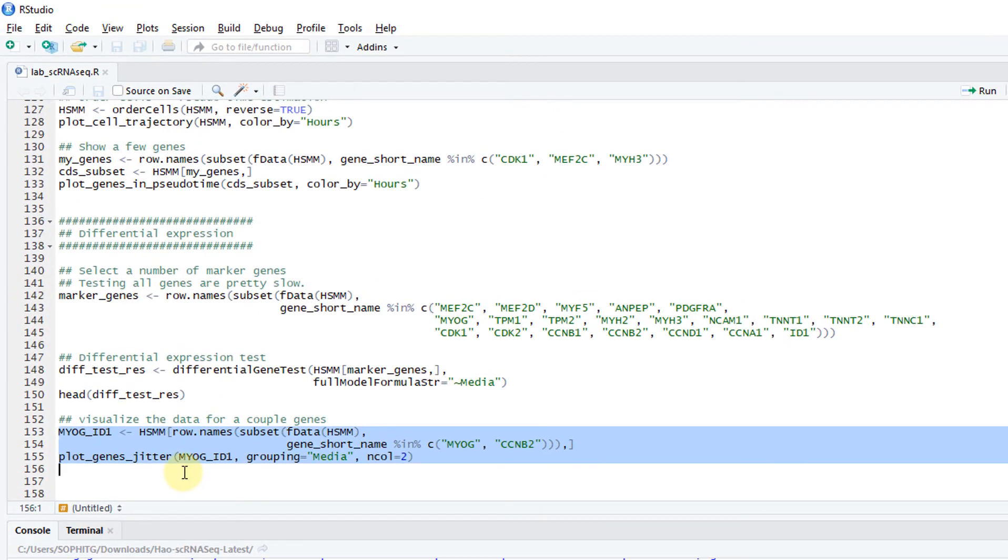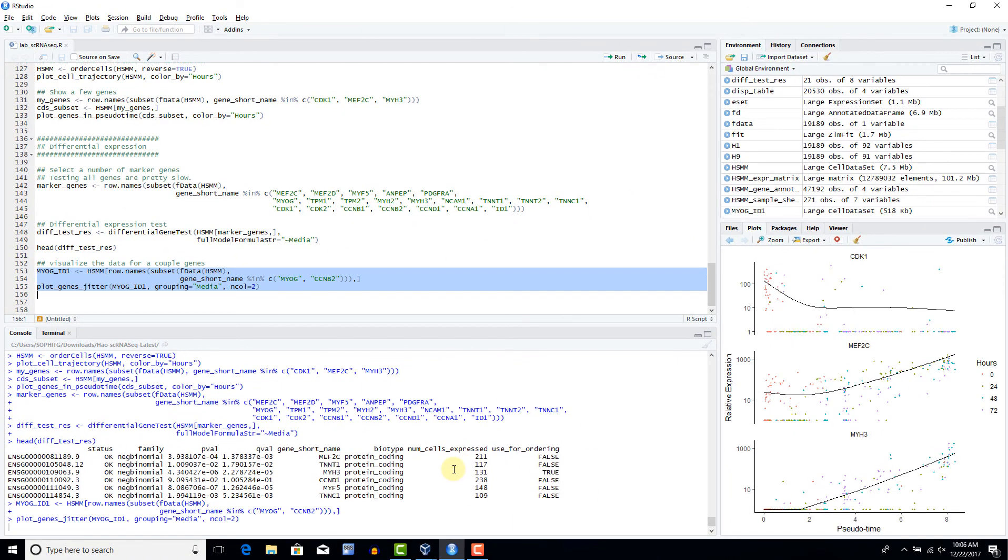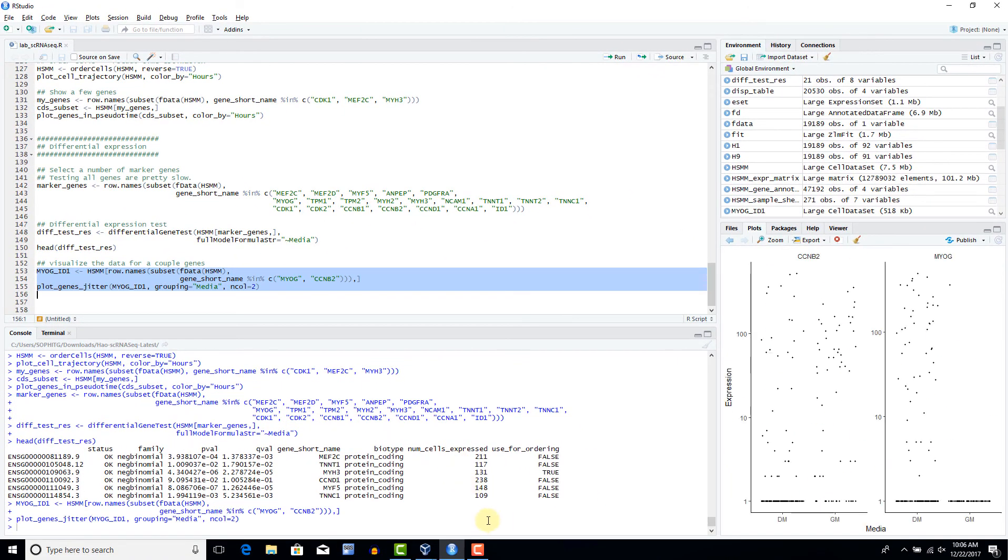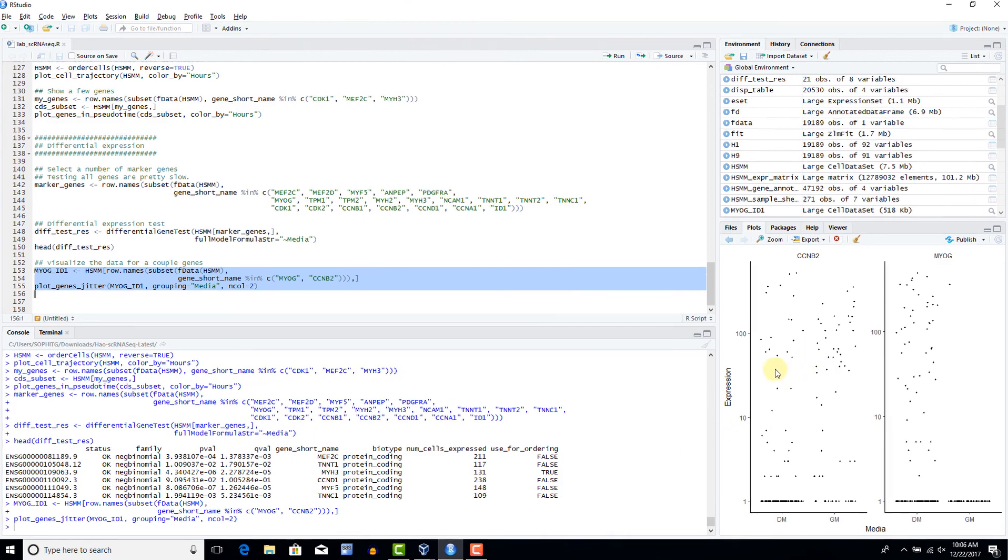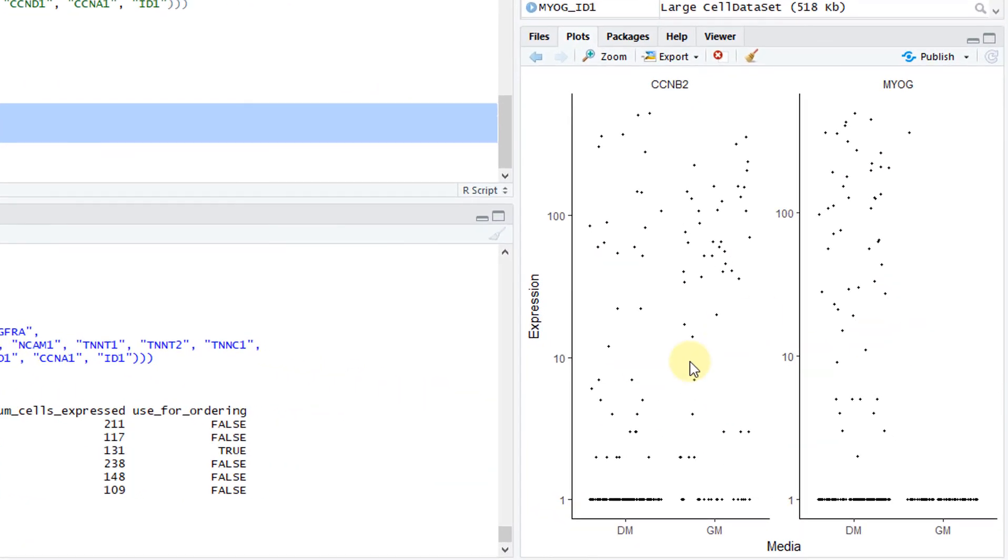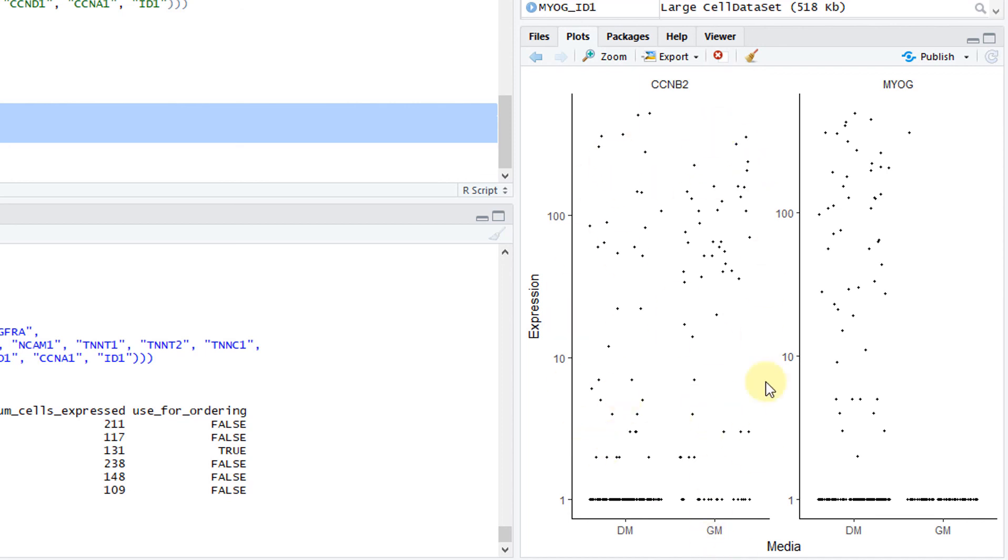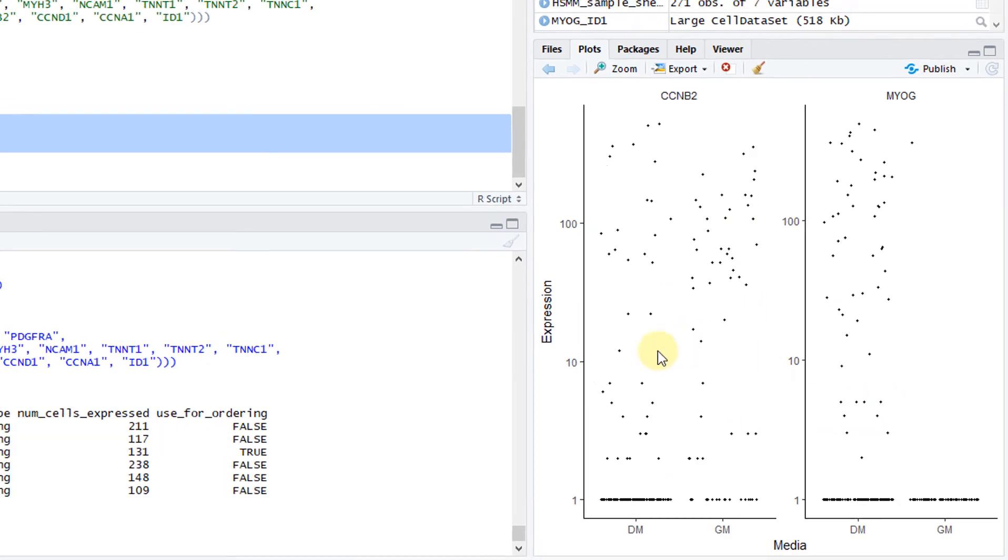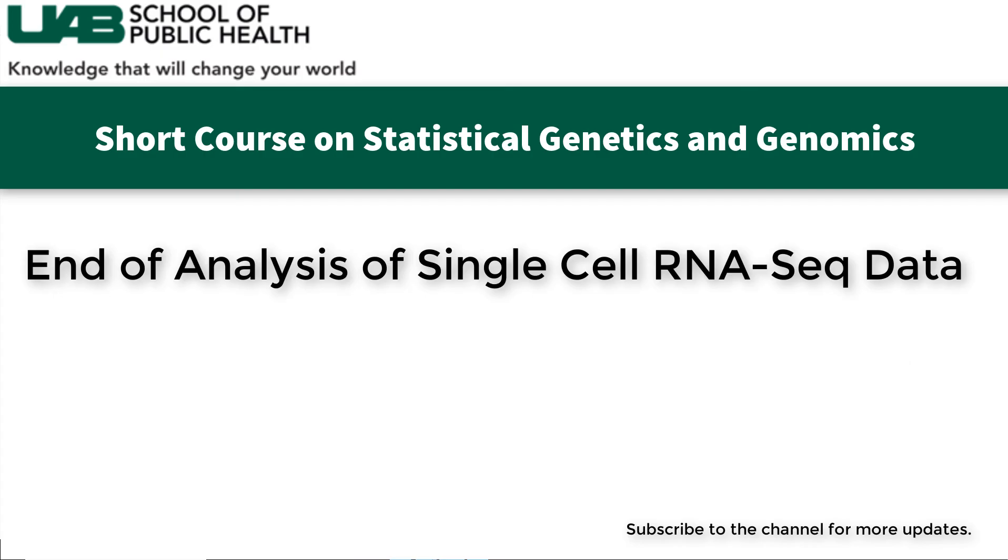Now you can visualize the data from a couple of genes. The DE data. Here are these two genes. You can see this one gene between two different medias, DM and GM. You can see this is in DM. This is in GM. This is another gene. You can see they tested the difference in the average expression values. That's it.